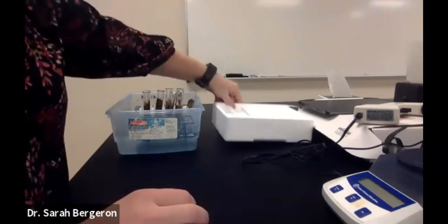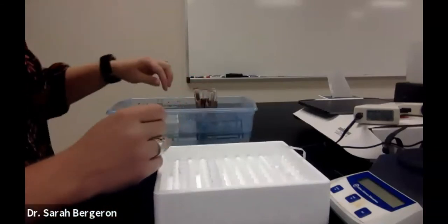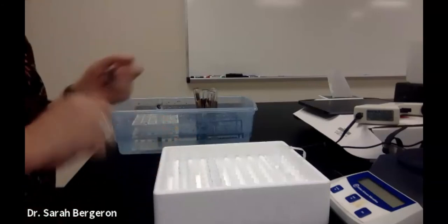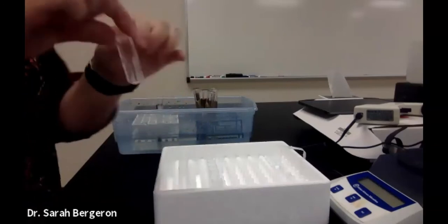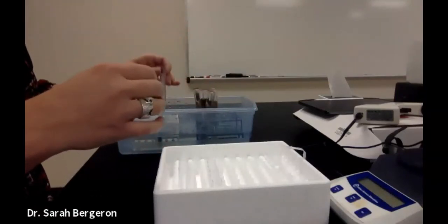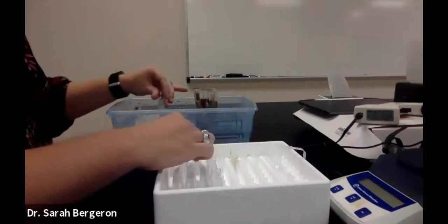All right, so they look pretty cool. So what I'm going to do is put my samples into cuvettes. I'm going to start with my standards. I want to make sure I put the right one in the right container. So hang on. Okay. So my 0. Now remember, you only have to fill these cuvettes up to about right there. That's what you need. So you don't really have to use a transfer pipette. You can just pour approximately what you need. And if you go over, it's okay. No big deal. Okay. Then 1.